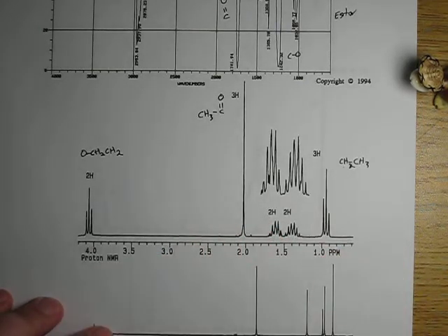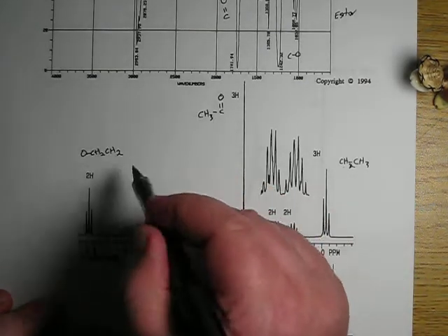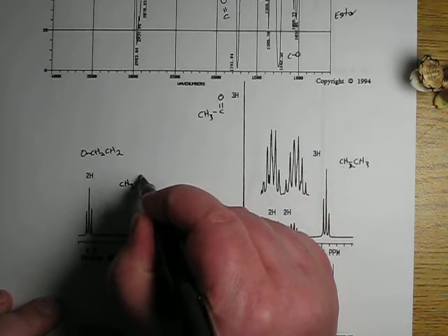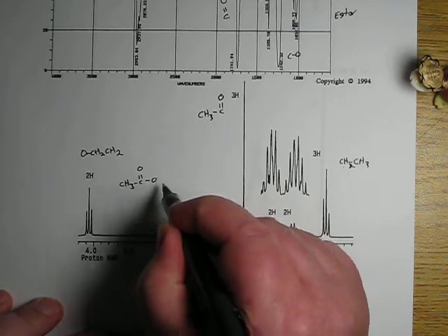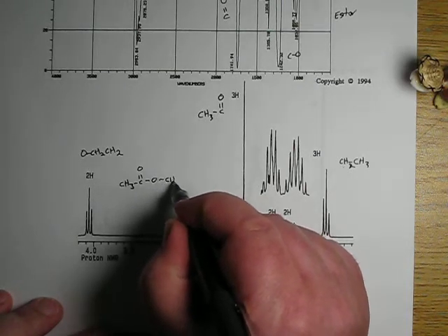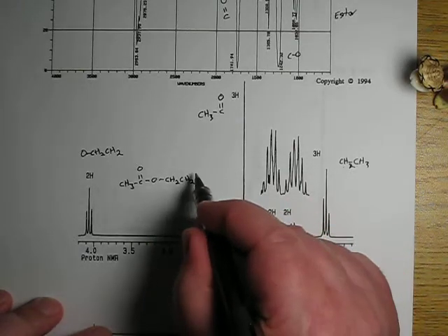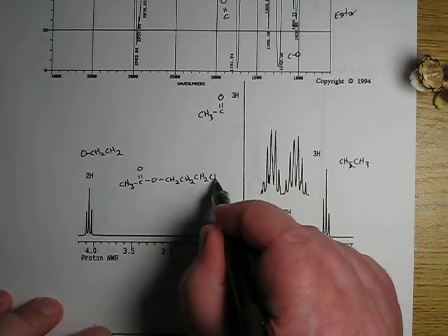These are the pieces of my molecule, and there's only one way to put them together to make a molecule. CH3, C double bond O, O. There's my ester, yay. CH2, CH2, CH2, CH3.